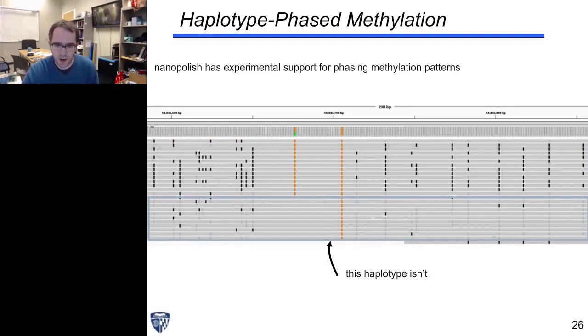You can see that whereas this region here is methylated, this region isn't. This region is all very methylated. This region isn't. So we're seeing allele-specific methylation. Your dad's copy of the chromosome might have been methylated, whereas your mom's wasn't, or vice versa. So we can finally really get at, using these long reads, long-range patterns of allele-specific methylation. So we're excited about that.